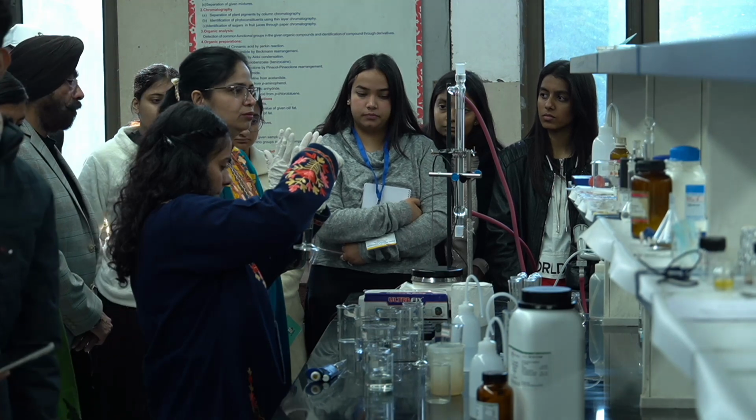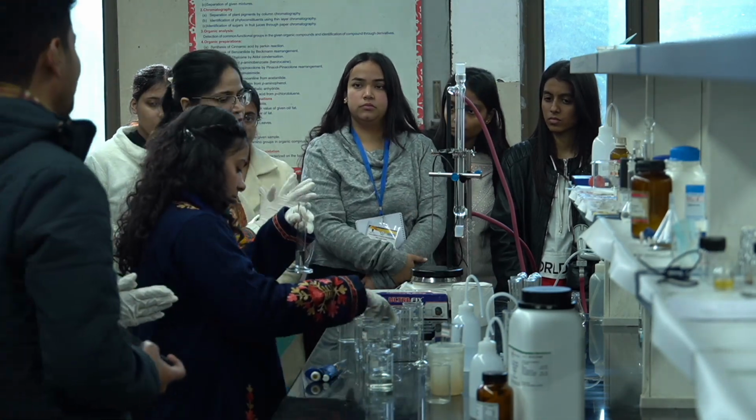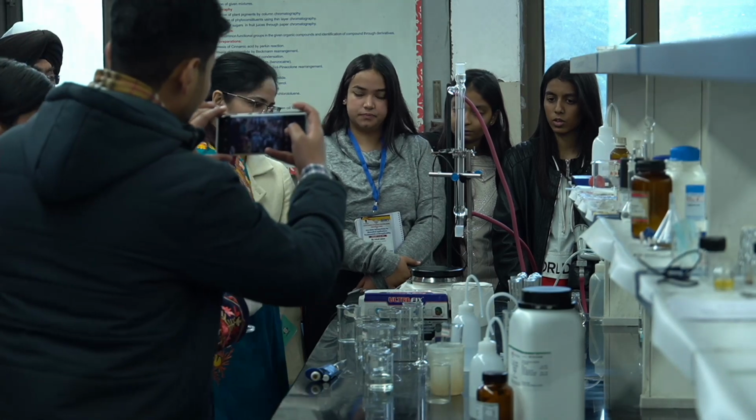I will show you the demo of how you synthesize the silver nanoparticles and then gold nanoparticles.